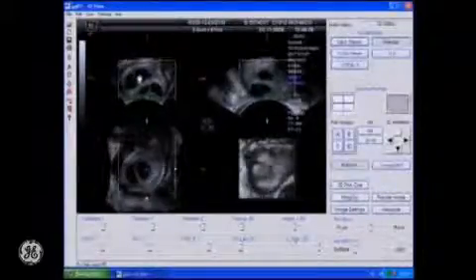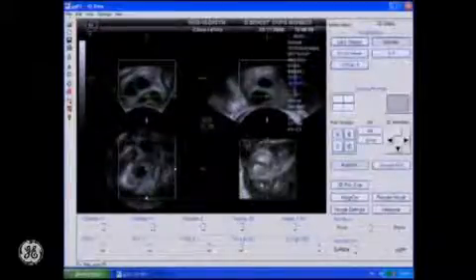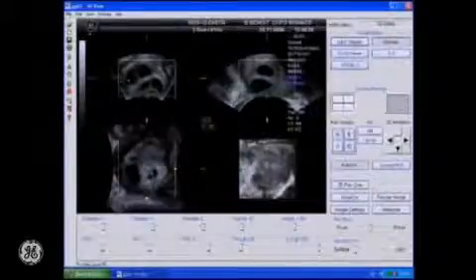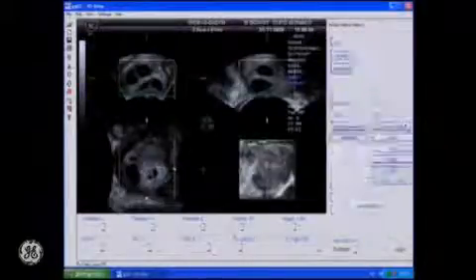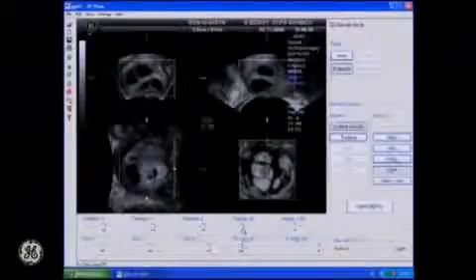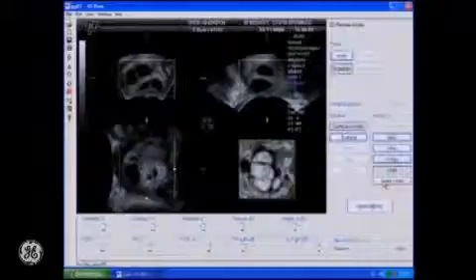And the result here is the 3D rendering of the ovary with follicles with surface mode. But you can use the inversion mode. The only thing you have to do is to put the ovary inside the box. And random mode, inversion mode, you play with the threshold. I prefer to use a gradient light.